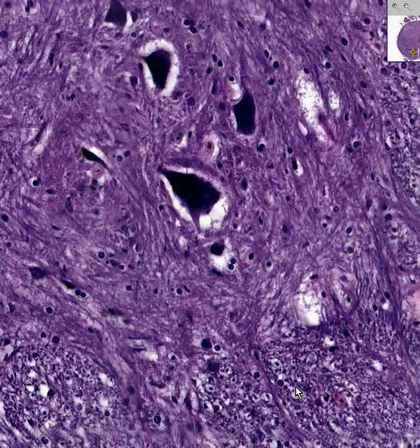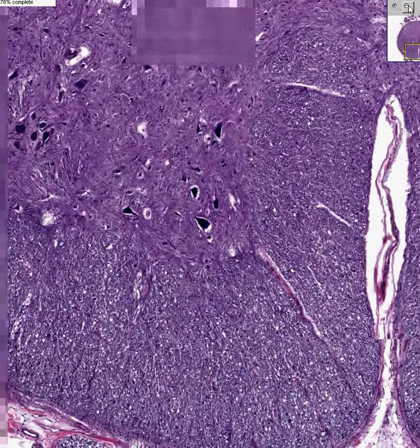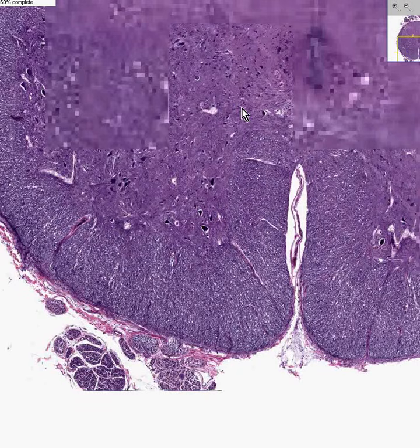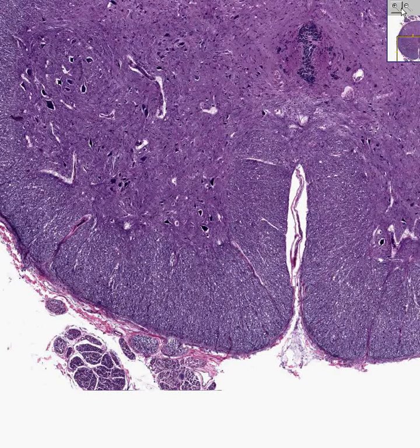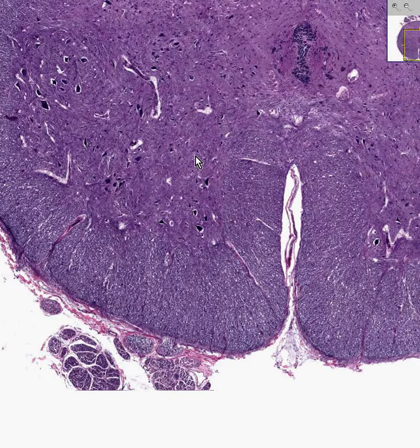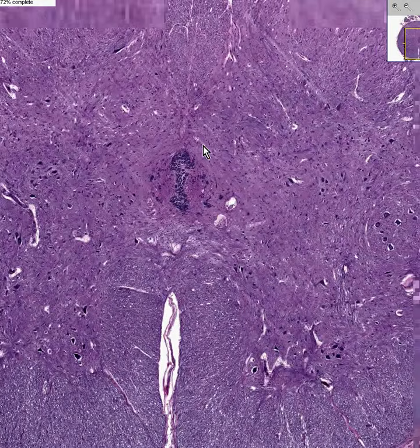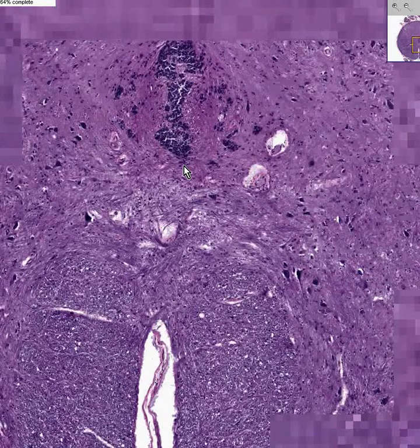Is there anything more we want to say about spinal cord? I don't think so. I don't think it's really good to get into all of these esoteric names if you just want to describe the basic histology, because you're not going to get anything from it. Well, I think what I want to do, because we didn't see the ependymal cells on any of the other slides, let's actually come in here and zip up this central canal of the spinal cord.